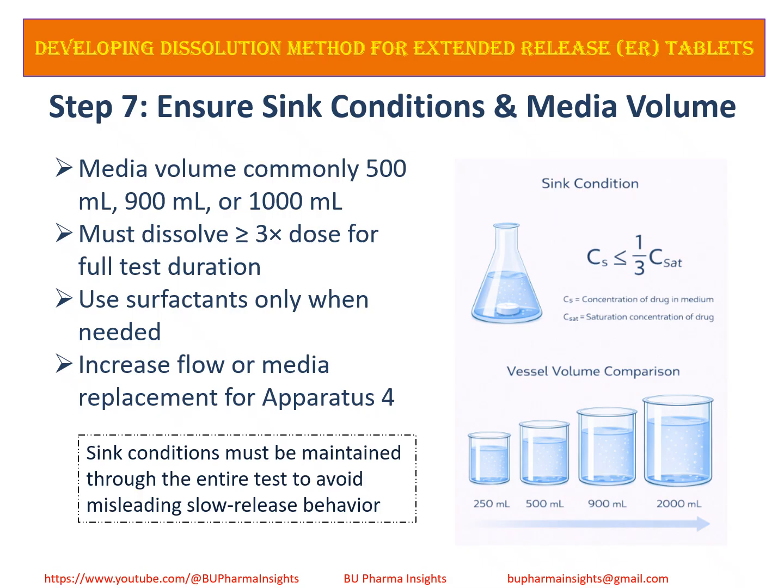Extended release tablets often have a high drug load, so maintaining sink conditions becomes critical. The dissolution medium must be able to dissolve at least 3 times the total dose for the entire test duration, not just at the beginning. Common media volumes are 500 ml, 900 ml, and 1000 ml.